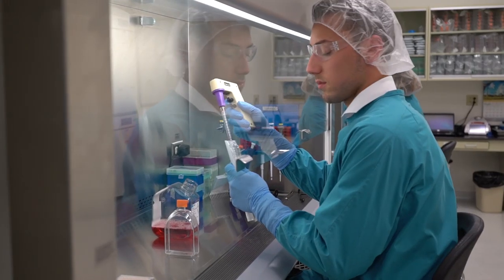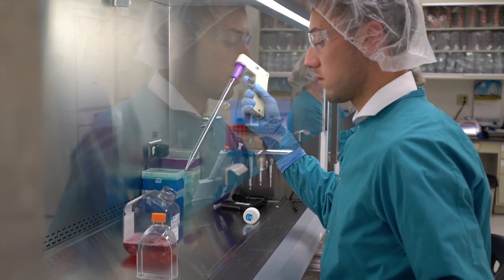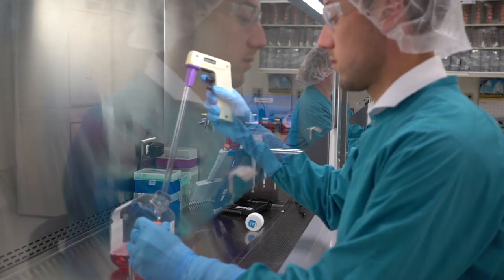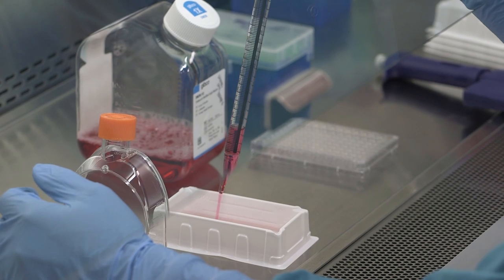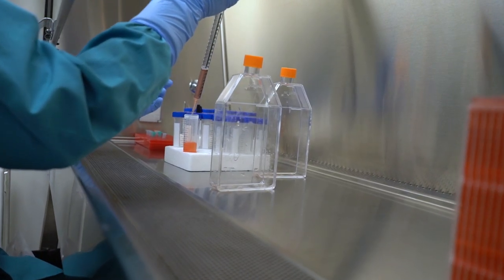Isotyping is another assay to confirm this. We do isotyping to confirm single clone to single antibody being produced and we will go ahead and subclone this clone multiple times to ultimately deem its monoclonality.